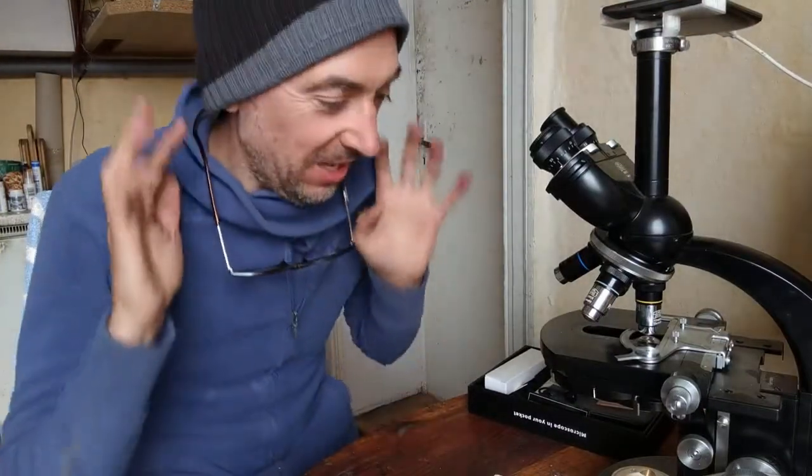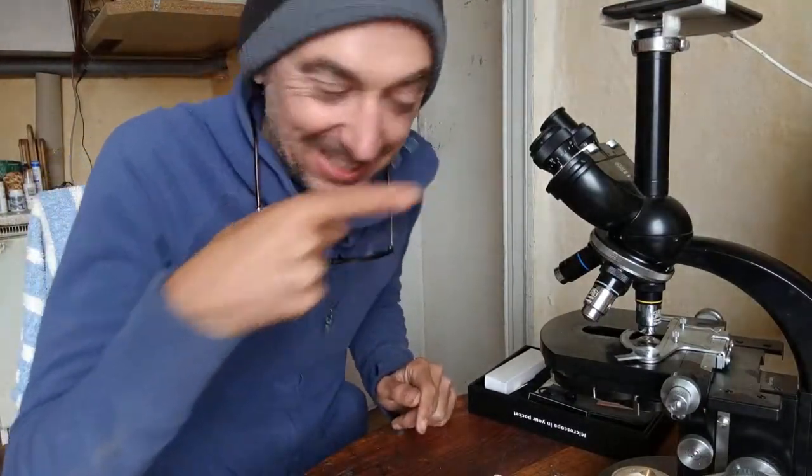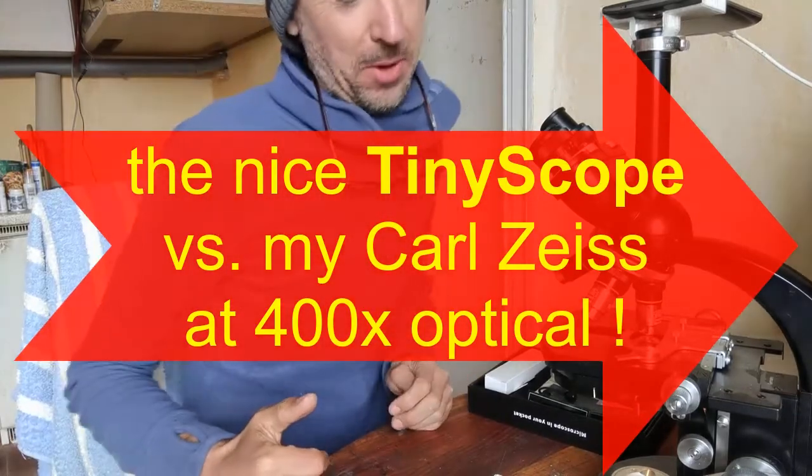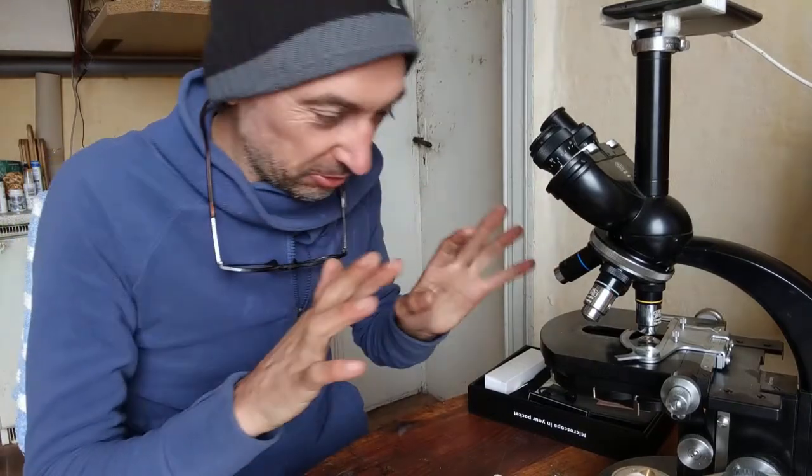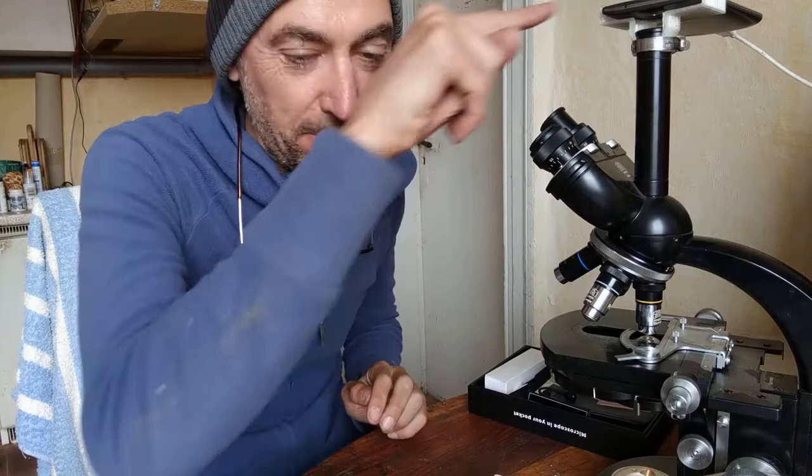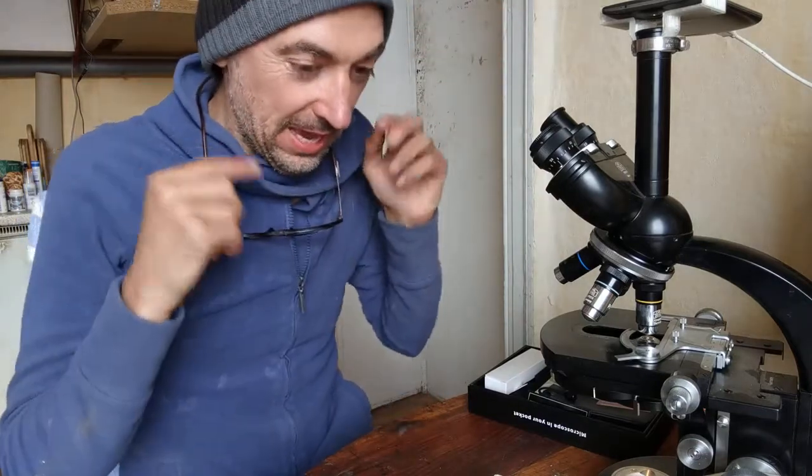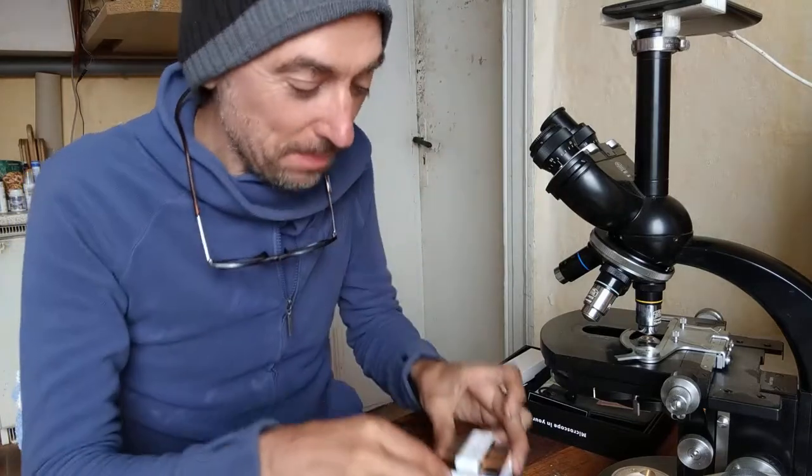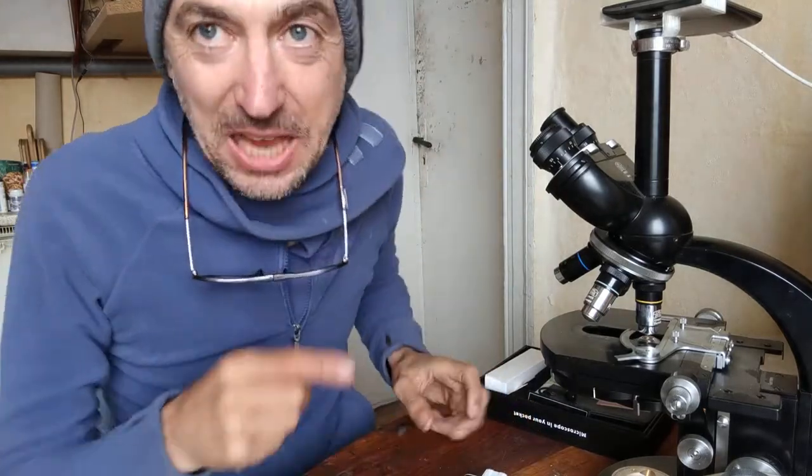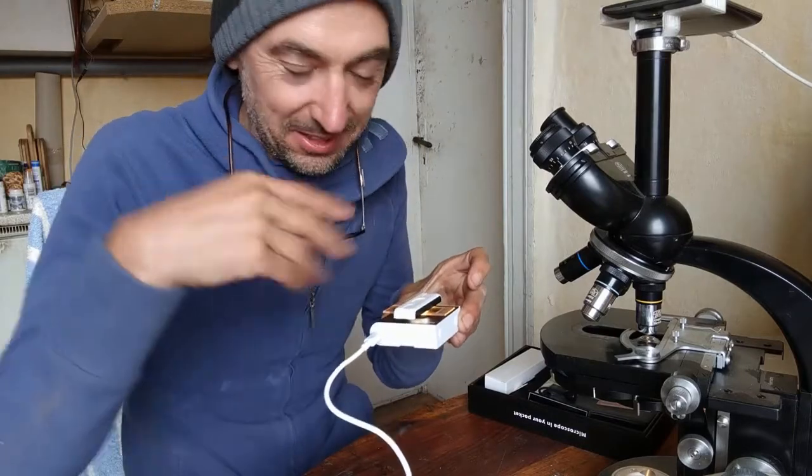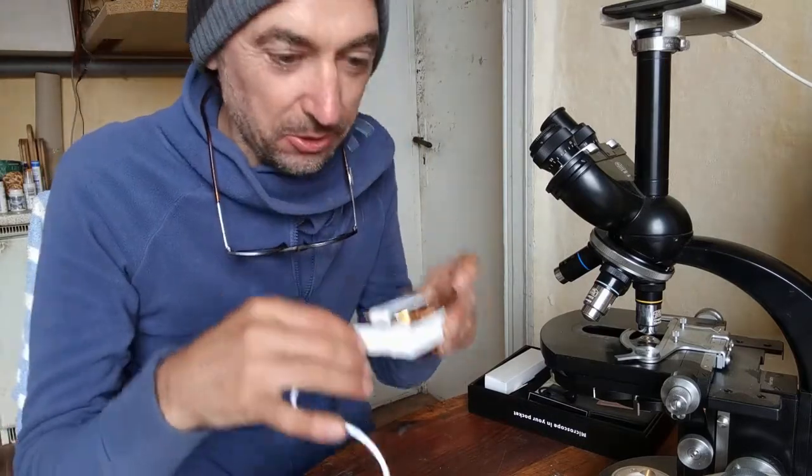I'm in a hurry, so here's a microscope up to 100x optical magnification with phase contrast - I never really got it to work. Here I have an adapter for a smartphone, and here is this nice tiny scope. You cannot really compare this to that, but this one you can use outdoors.